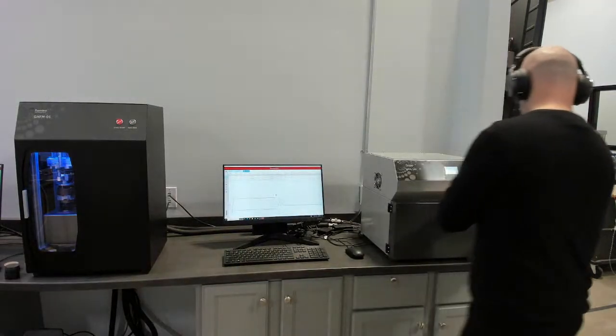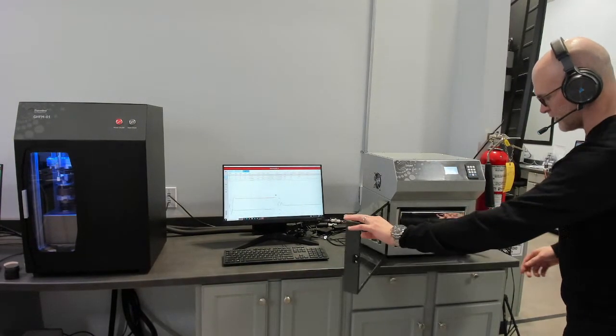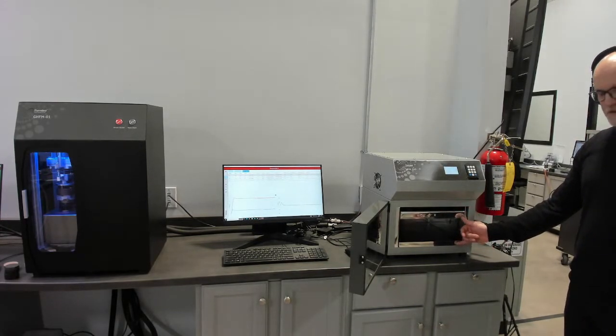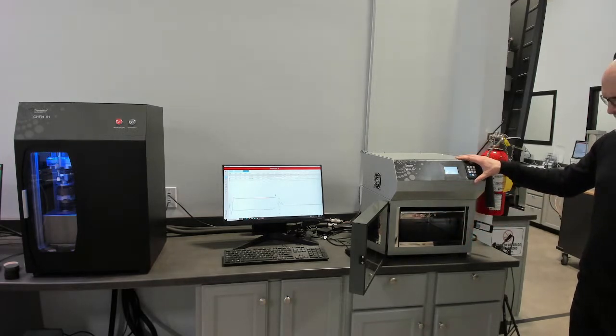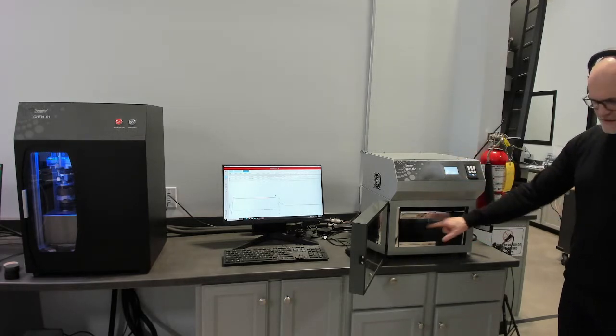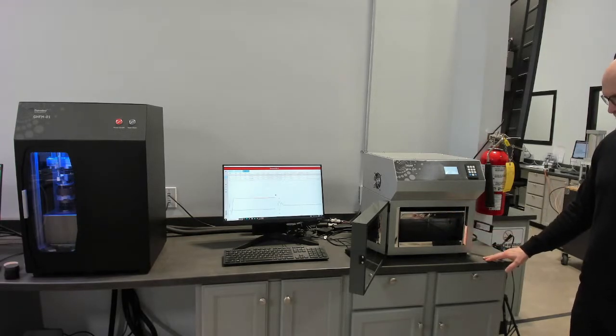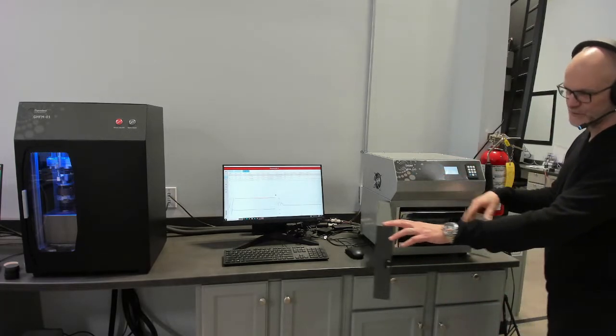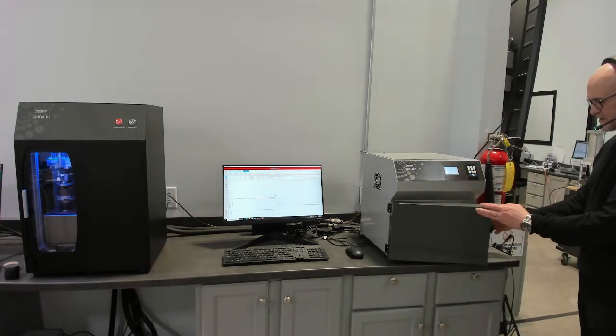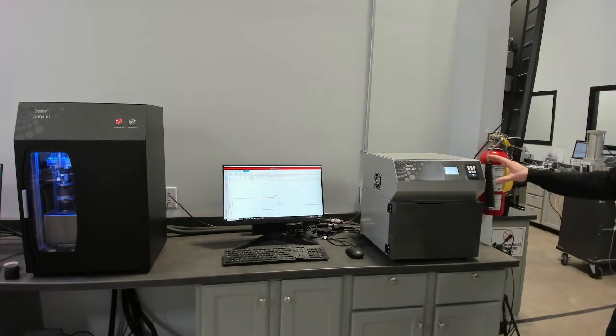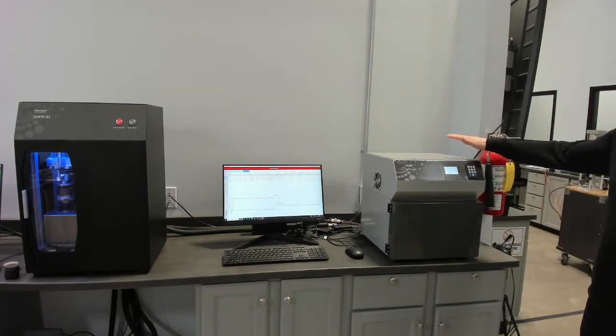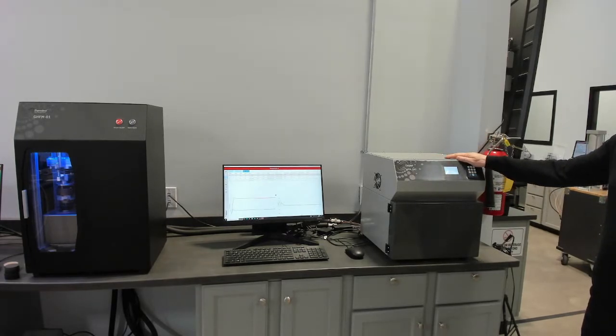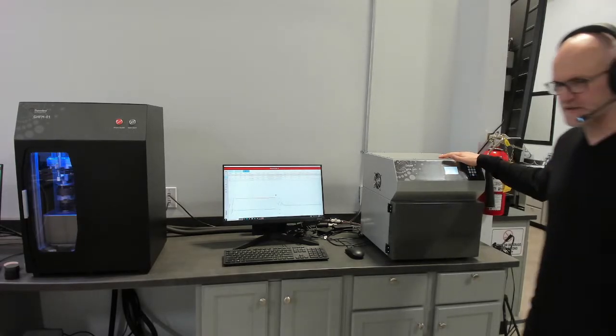The sample size for this model is 12 inch square or 300 millimeter square and up to four inches thick or 100 millimeters thick. There's another sample configuration size for eight inch square and up to two inch thick or 50 millimeters thick. The standard temperature range for both devices, the HFM 100 and HM 50, is plate temperatures of minus 20 to 75 Celsius. We have a new high temperature version of the HFM 100 which is minus 30 to 110 Celsius.